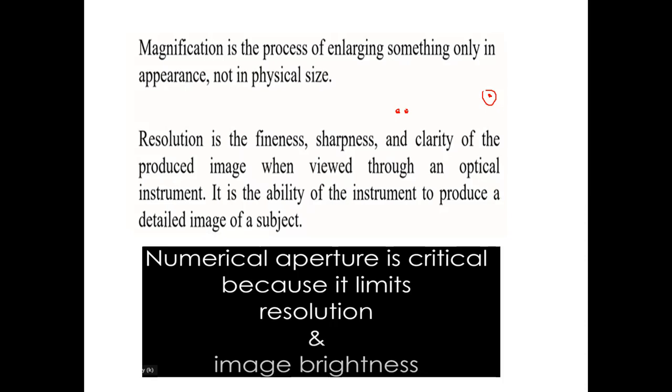If this doesn't happen, it means your numerical aperture is limiting your resolution and also the image brightness, which should not happen. So what is the solution for this?